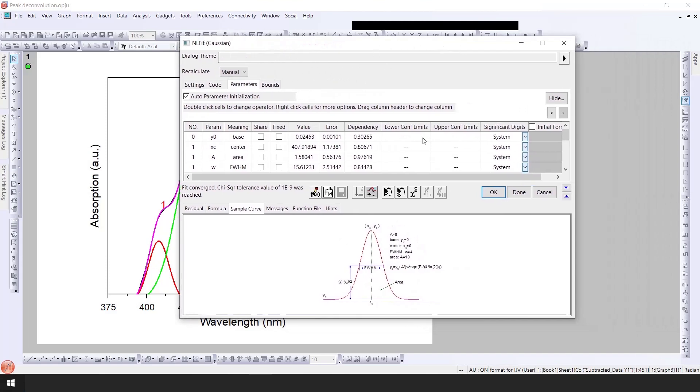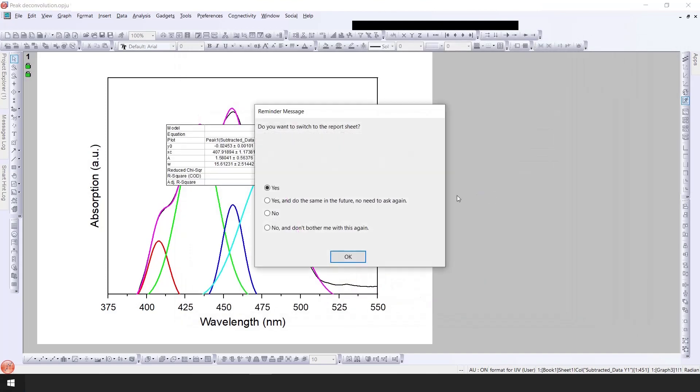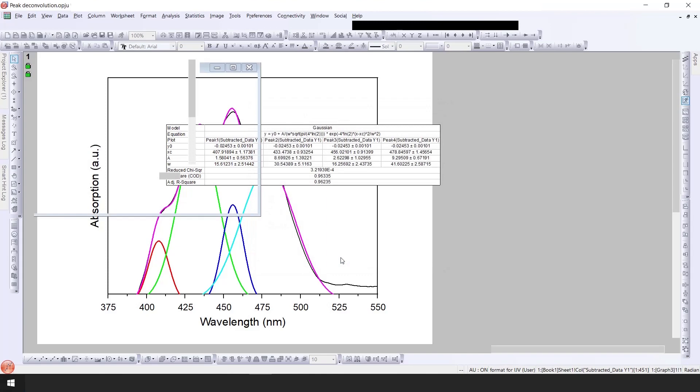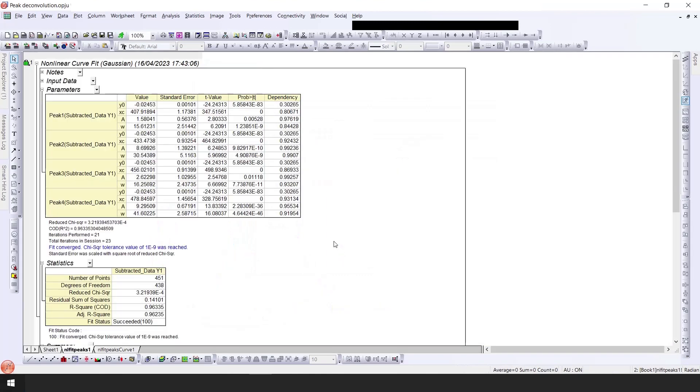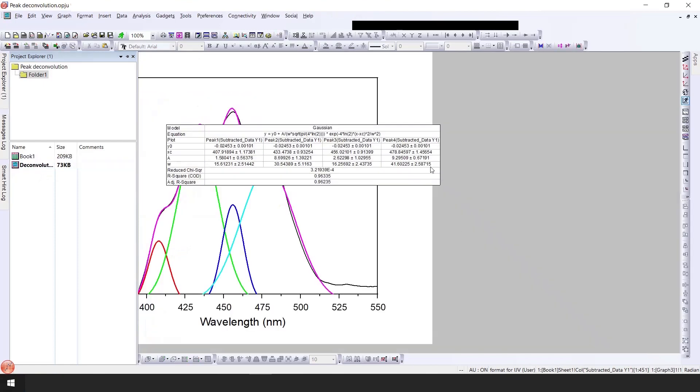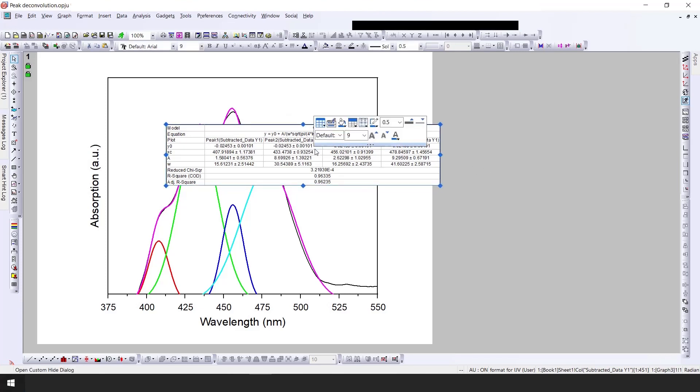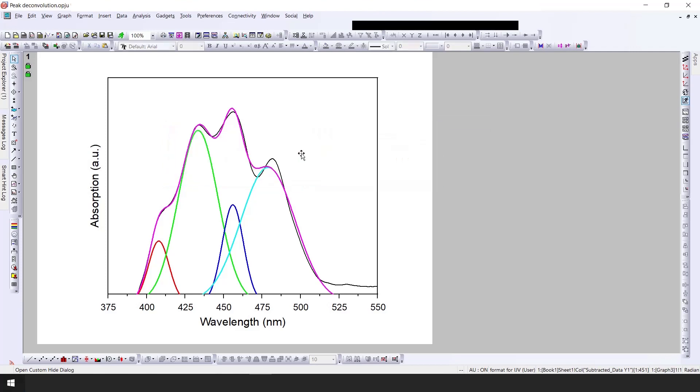If I click OK and then you can see here if I go to the deconvolution graph. This is the information about each peak. You can see here the peak one, peak two, peak three, and peak four. We can also access this information in the booklet. I will click here and delete this one.